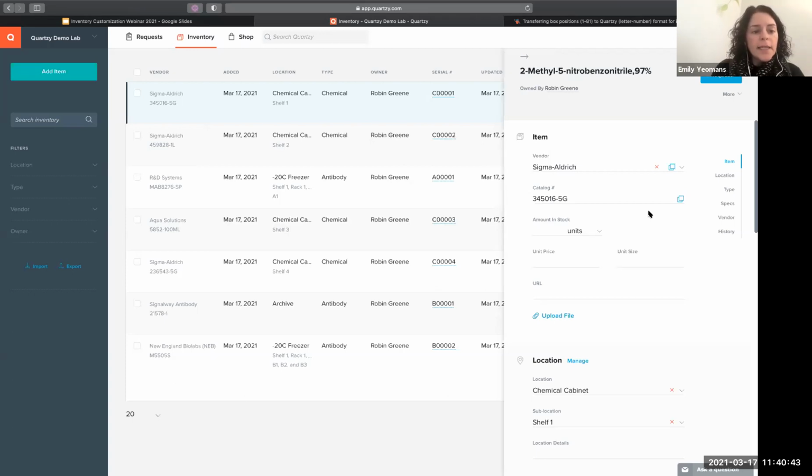There's just so many really good ideas in here. Will it show as a picture? It will only show as the name of the file, and you'll always need to click that and it will download to your computer.